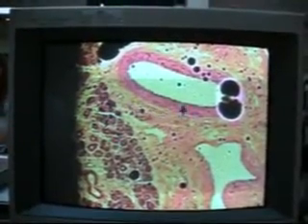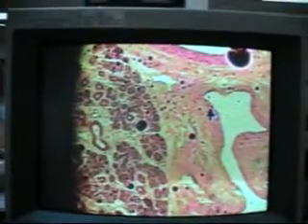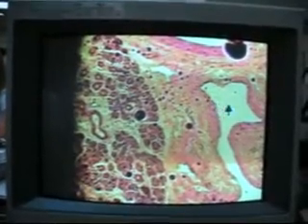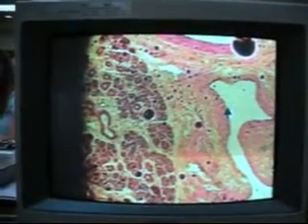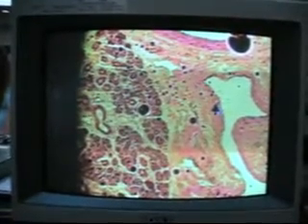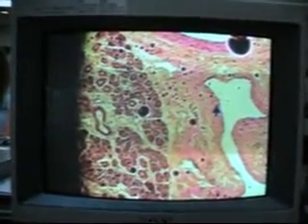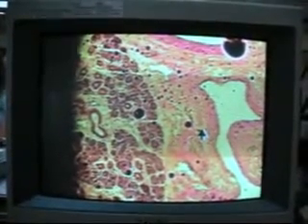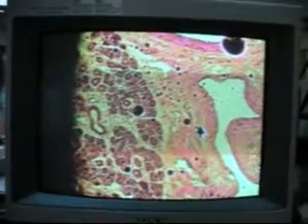You can see that. Okay, now we'll come back to a little higher magnification so we can see that. You can look here, again, this is a lumen, there are going to be endothelial cells along the edge, and then this layer right here is going to be thin, but this is going to be smooth muscle cells here, and then the adventitia is going to be out in this region here, all right? And not all the cuts are always perfect.